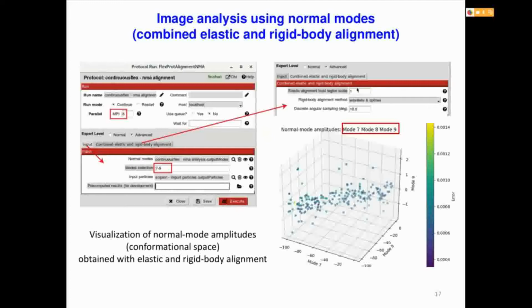In principle this parameter should not be changed, but the user can change it if they suspect that the conformational change is not as big as they would expect. They can change this from 1 to 1.2, 1.5, up to 2 maximum. It should not be increased too much, but you can decrease it if you wish.